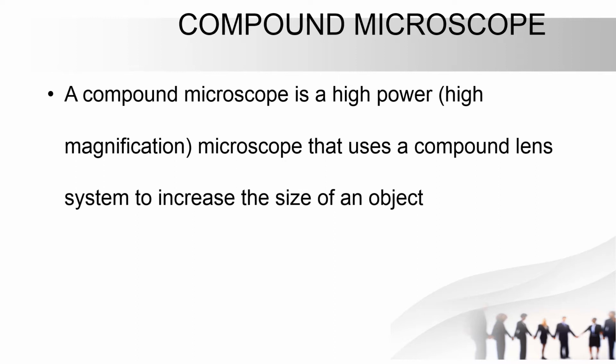So the name compound is generated from a combination of lenses to give a high power magnification in order to increase the size of the object under review.